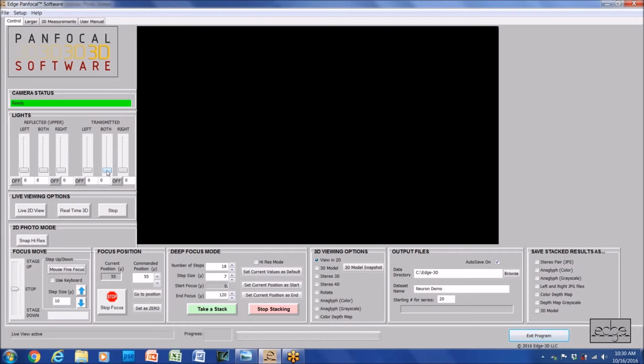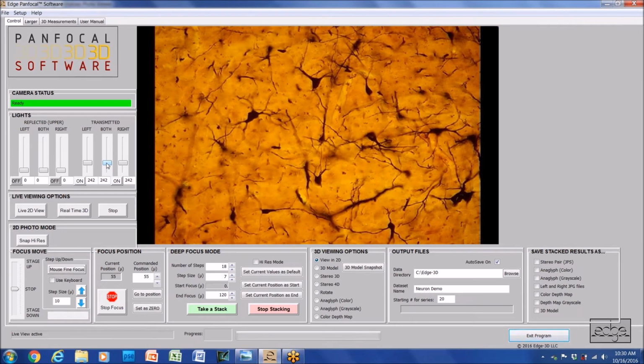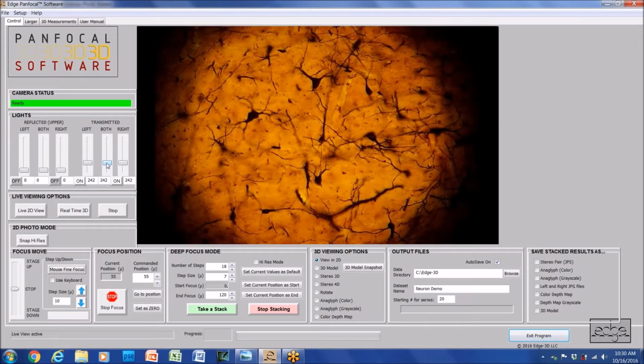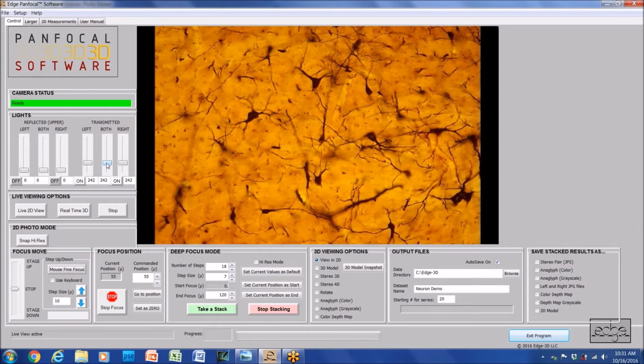So right now we have a brain section. I'm going to use transmitted lights to look through this brain section. You can see some neurons there. And one of the first things you'll always want to do is make sure that you're focused. I'm just closing down the field stop to make sure that our condenser is centered and focused. So we're about in the middle. This is about 120 micron thick section through the brain. Now normally people would take 5 micron sections. So we're taking sections that are more than 20 times thicker and seeing it all at once and in 3D.